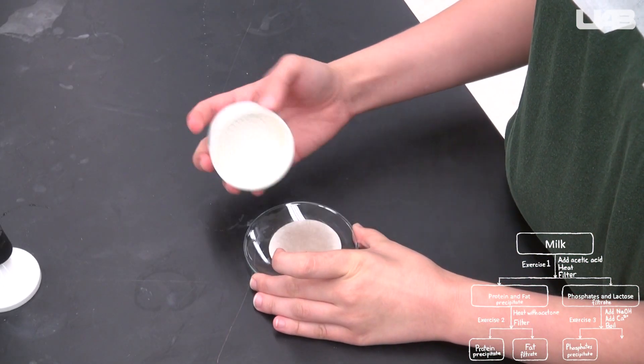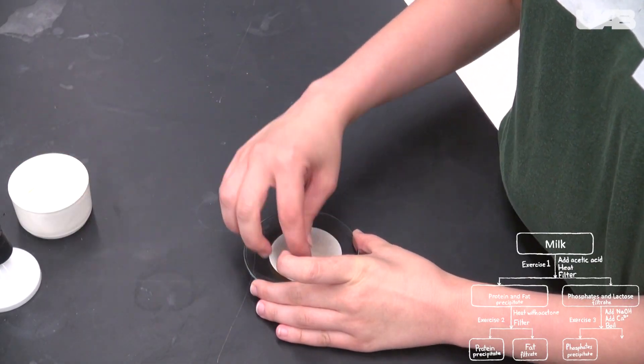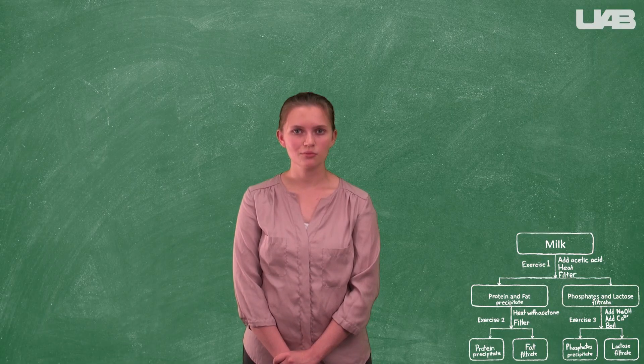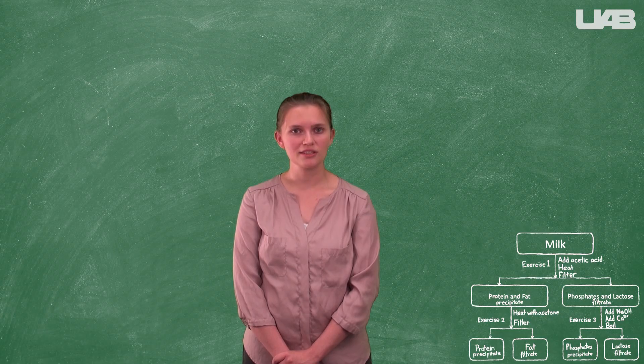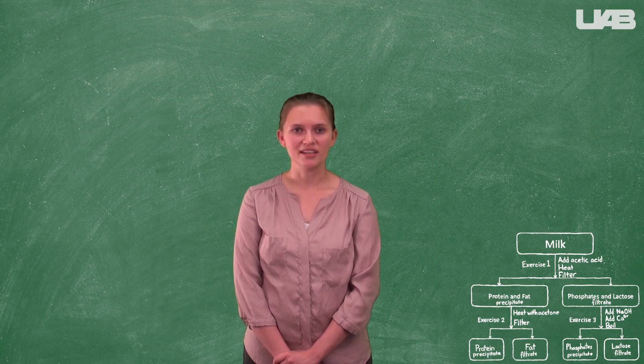Use the Buchner funnel again to filter out the calcium phosphate precipitate. Once the solid is dry enough to be easily removed, empty it onto a watch glass. Pour the filtrate, which contains the lactose, into a beaker and get ready to perform the Benedict's test.